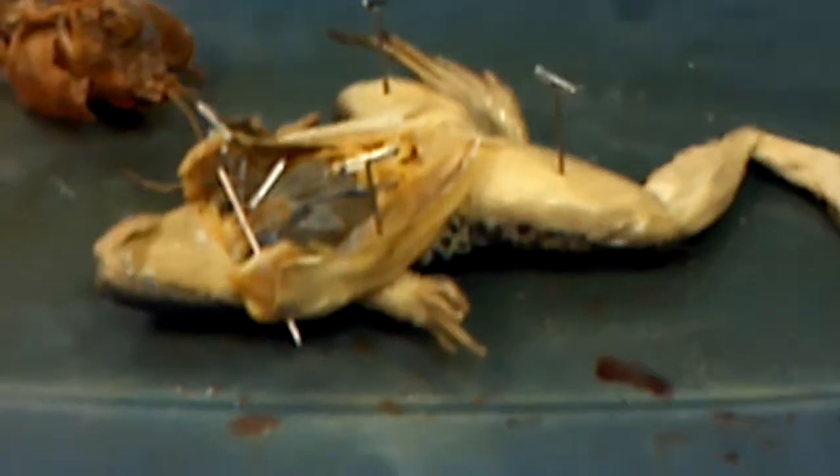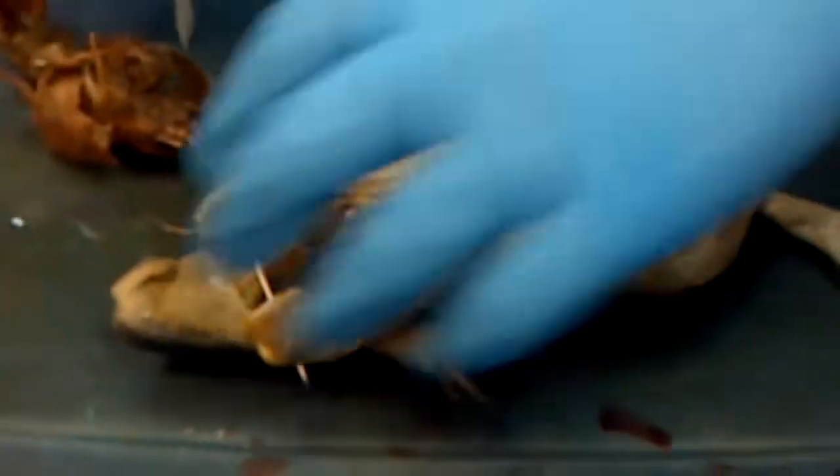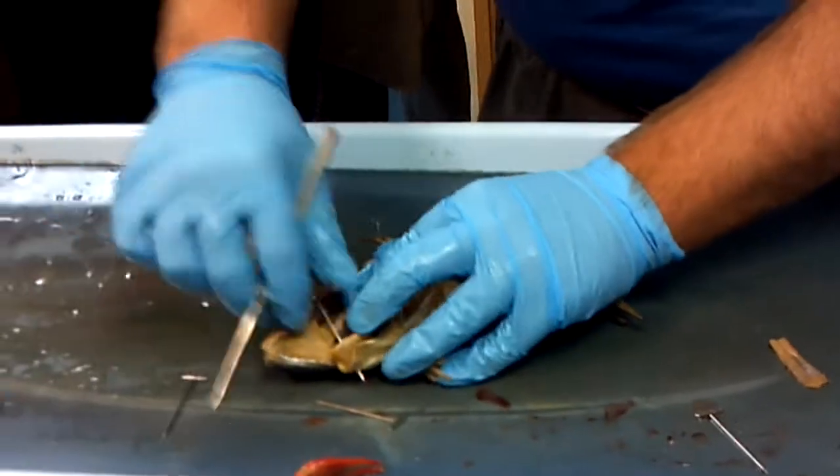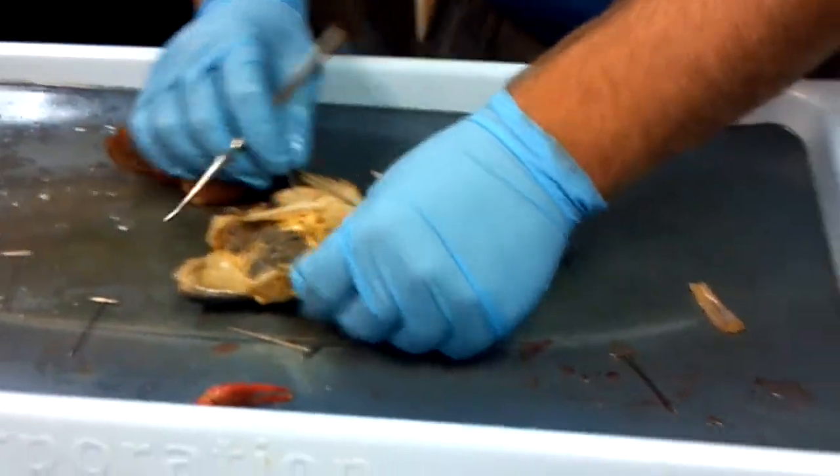If you don't want to listen to me talk, you can just grab one and look at it and make sure you know all the parts, because you're going to be examined on this very soon. Alright, here's my frog.